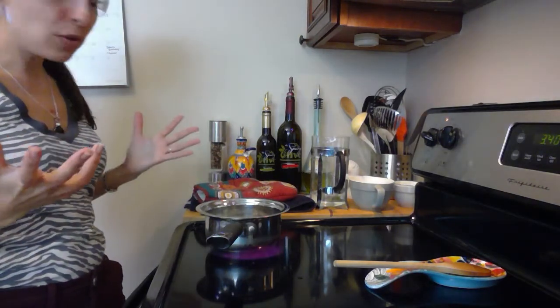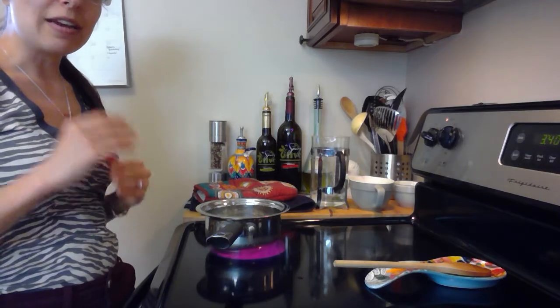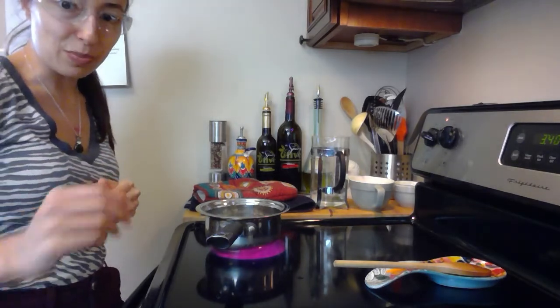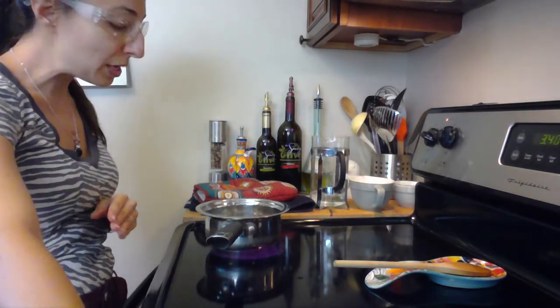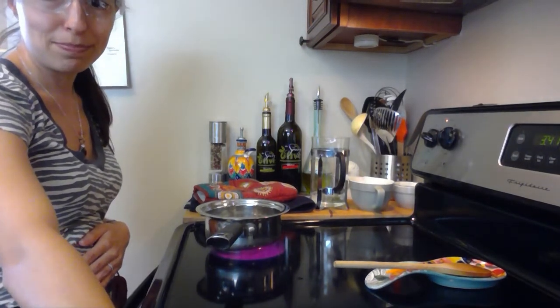Okay, now I think you guys get the idea, so I'm not going to go all the way through, but I will let you try it out on your own and collect your own data points. So make sure to get it all the way to boiling, take your last temperature, and that's when you can stop your timer.